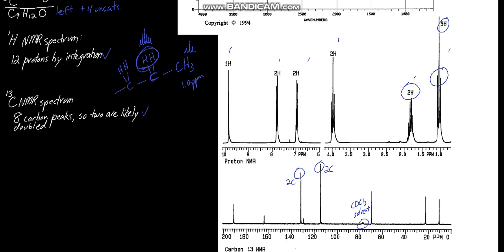Now, look at the chemical shift here, 4.0 ppm, and the only thing that really can de-shield protons, and probably this carbon as well, to that extent is an oxygen atom. So if you look at your tables, that can be seen, and so look at all these pieces we have connected together by interpretation of the splitting.